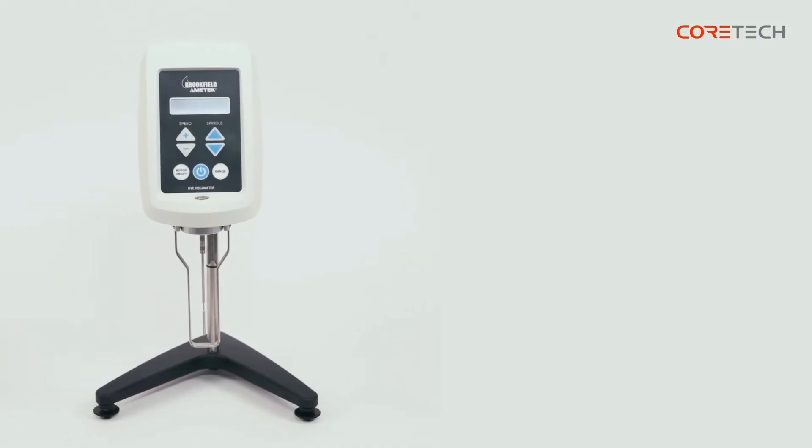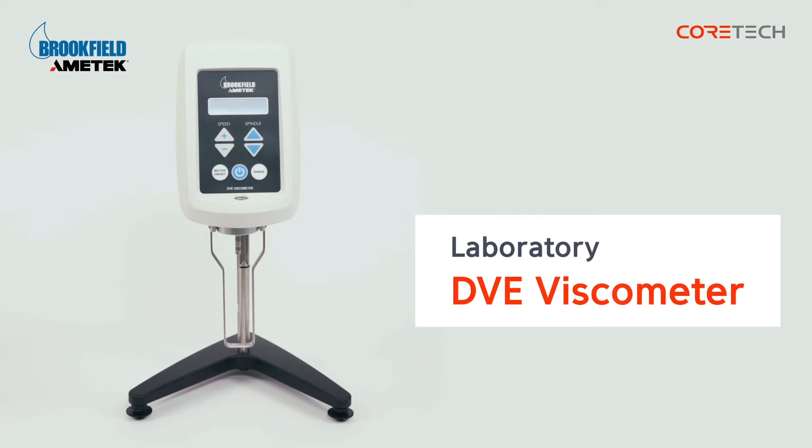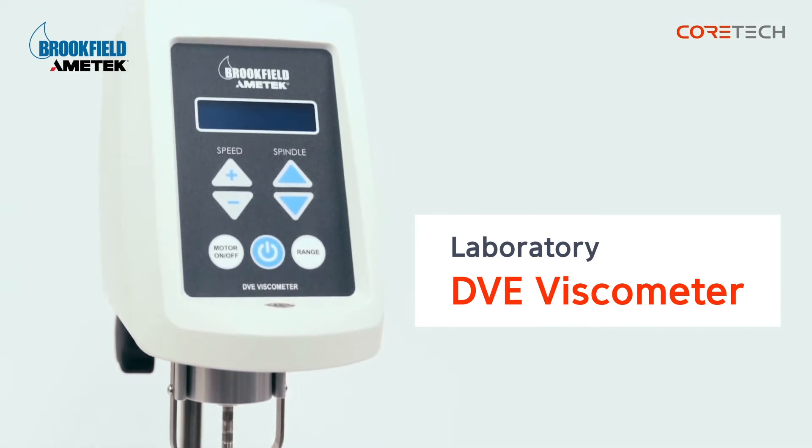Hello, this is CoreTech Korea. The product we're going to talk about today is Brookfield's Rotary Viscometer DVE model. This model is suitable for routine viscosity measurements.